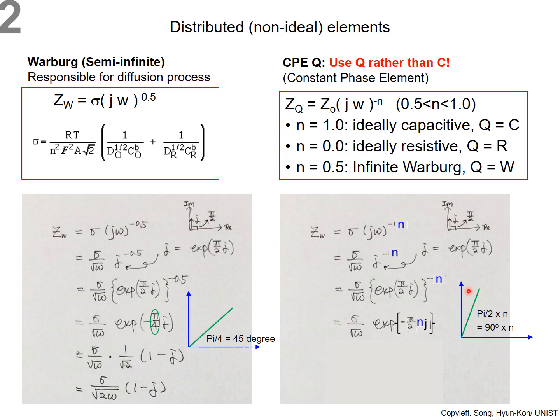So usually we are using the CPE, constant phase element, instead of Warburg and instead of capacitance in the simulation program.